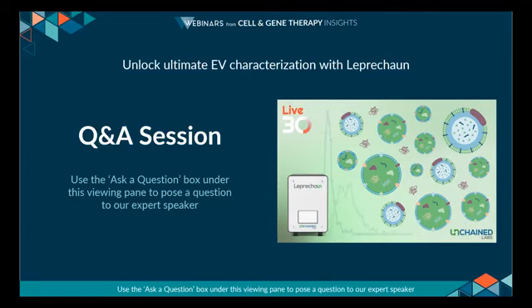We don't sell FISH probes or molecular beacons, but we can show you what previous customers have done and how they've gone about this and how you might be able to adapt that for your particles. So yeah, protein, nucleic acids, other cargo, it is possible with some adaptation of the assay. That's really helpful. Thank you.